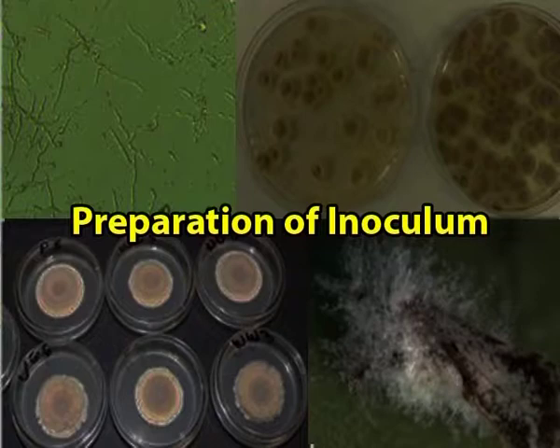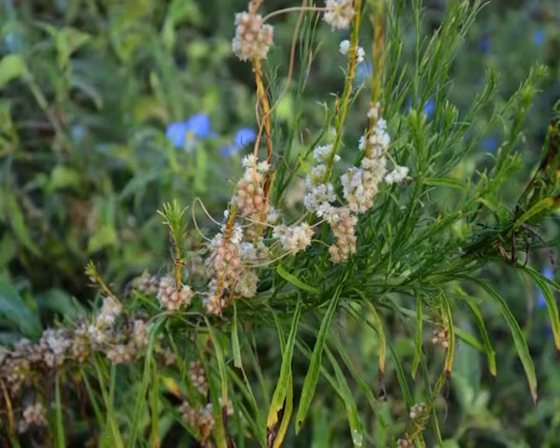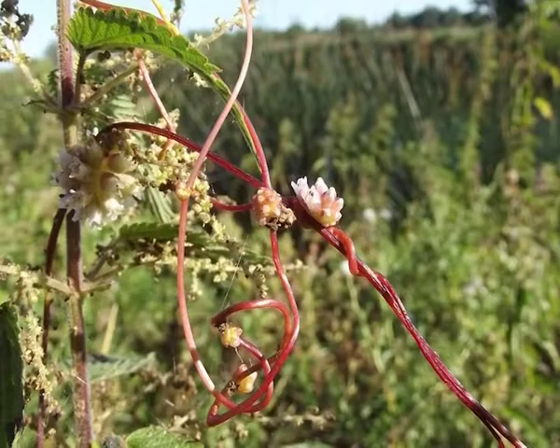Preparation of inoculum. Inoculum preparation for Koch's postulate tests requires isolation and culture of the putative pathogen. Otherwise, inoculum is prepared by using field collected or laboratory infected hosts. In addition, some obligate parasites require production in an intermediate host. There are separate procedures for isolation, cultivation, propagation and determination of the pathogenicity and virulence of particular microorganisms or nematodes.